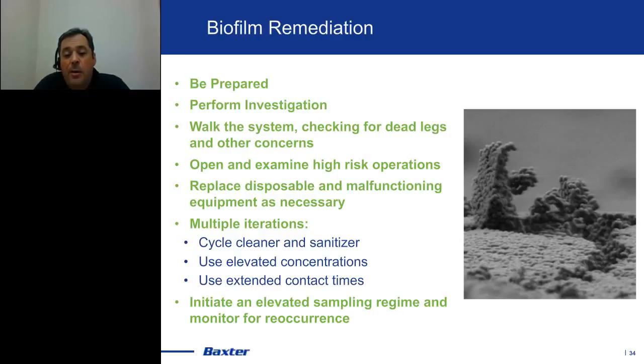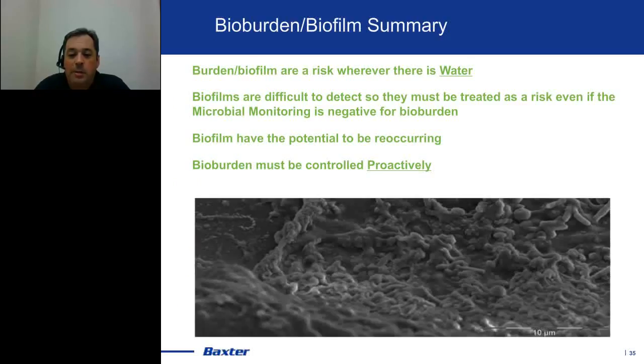After you've done that, I would highly recommend that you do some elevated sampling for a while to really make sure you've returned to a state of control. And I kind of like this biofilm picture. This was done by our microscope group here at Baxter, and it looks like something's crawling out of this biofilm. So kind of like it from the remediation standpoint.